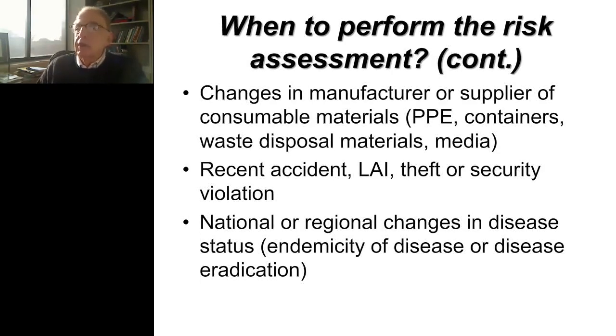Now, another time to consider is on this slide, changes in manufacturers or suppliers. If there's been a recent accident, a lab-acquired infection, an exposure, or a theft or security violation, then consider doing your risk assessment. A national or regional change in disease status, such as a new disease becoming endemic in your area, also makes performing the risk assessment appropriate.